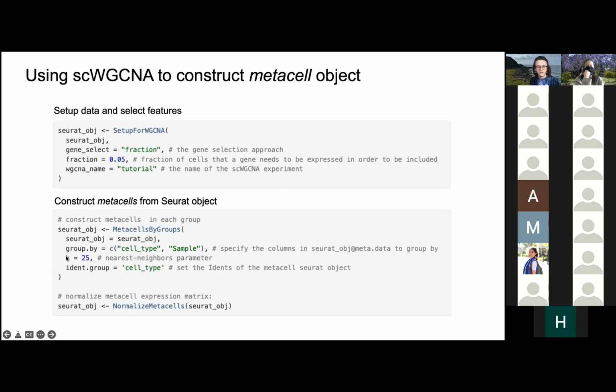And then this function, it's, I don't know, it's not like the fastest function in the world, but it'll probably give you results in like 20 to 30 minutes, and then you can kind of be on your way.